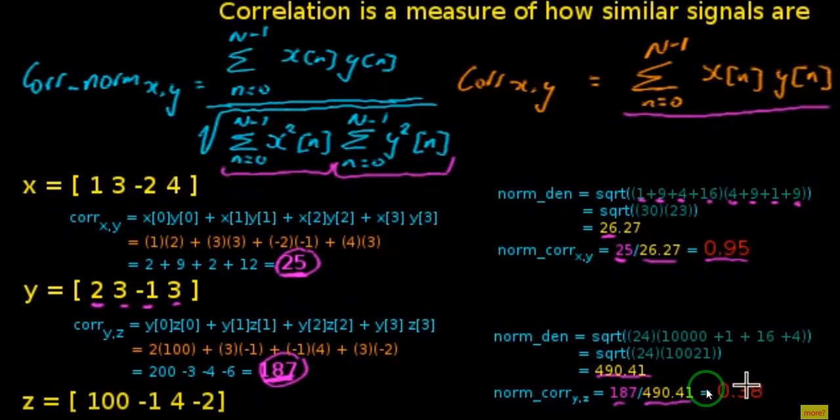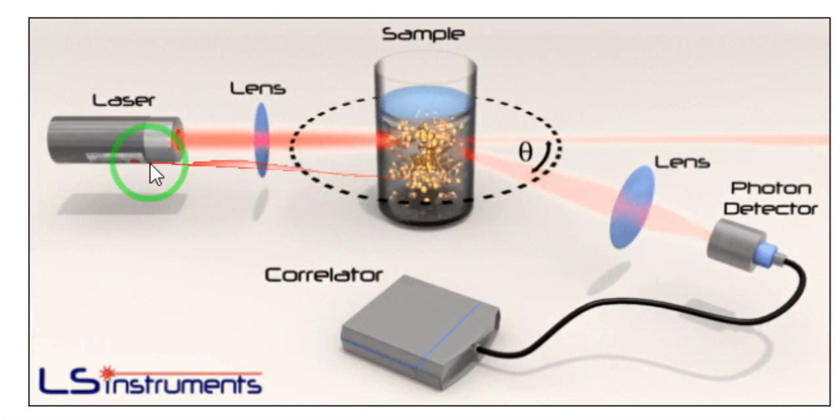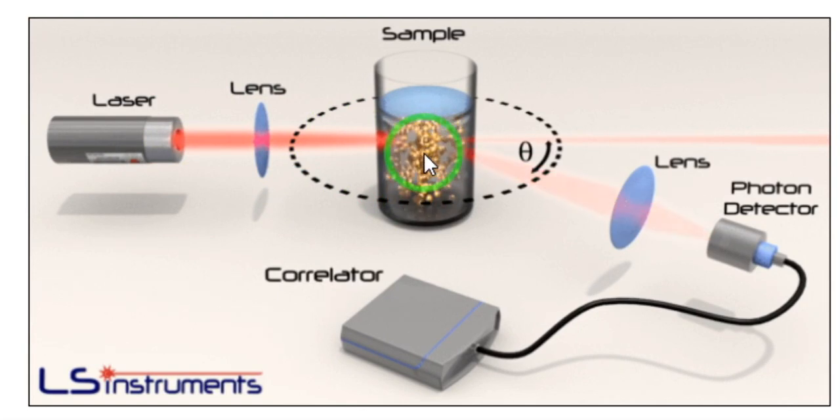So this is the basic idea that we are going to use in order to extract the information about the size of the nanoparticles which are dispersed within a medium. We told you that we have the apparatus here which shines the incident light into the medium containing the nanoparticles, and after that the light will be scattered and reach the detector, and the pattern will be formed.